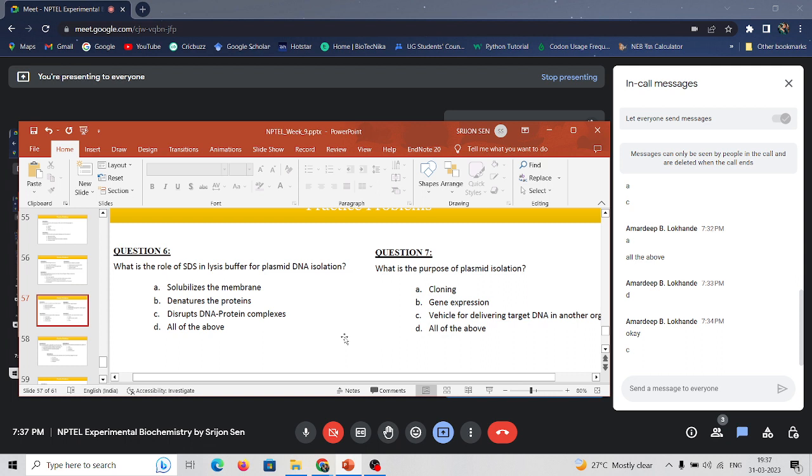Okay. Next question: what is the role of SDS in lysis buffer for plasmid DNA isolation?